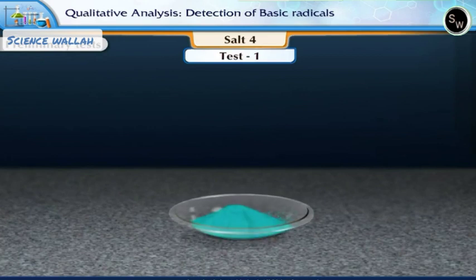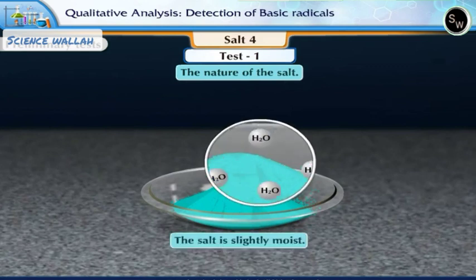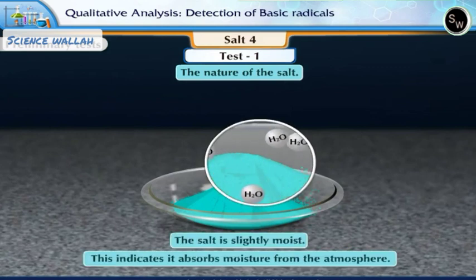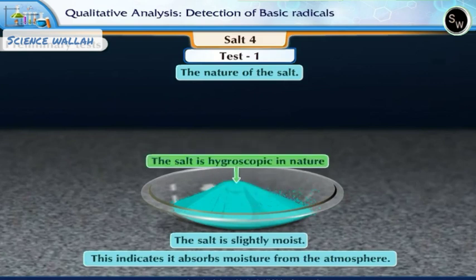Test 1. Let us find out the nature of the salt. On observing the salt, we can notice that the salt is slightly moist. This indicates it absorbs moisture from the atmosphere. Therefore, we can say the salt is hygroscopic in nature.